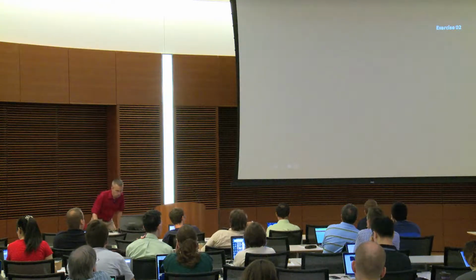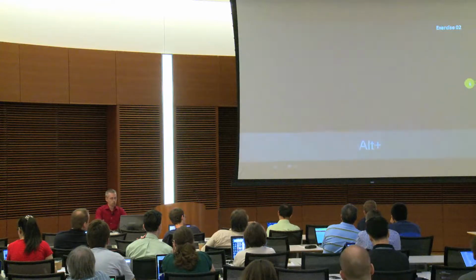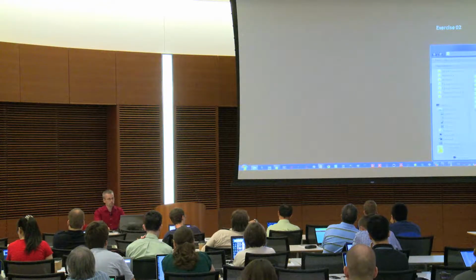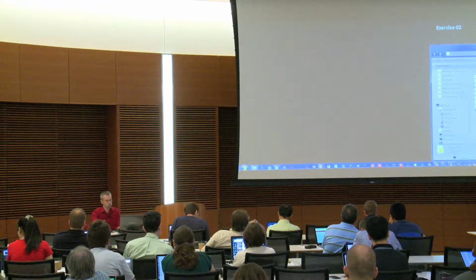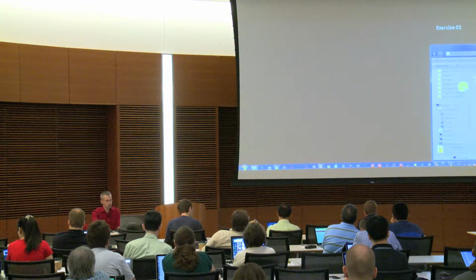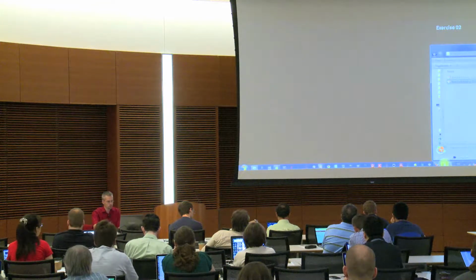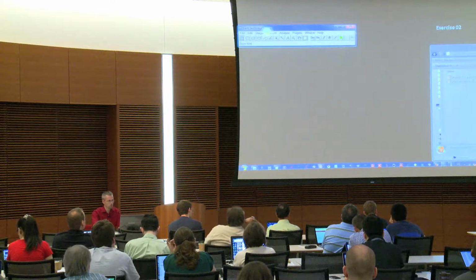If you want to test that, go to the images and files you can download for exercise 2. There is one image, which is here first, unequal lighting, DIC. That's the first one we will have a look at.